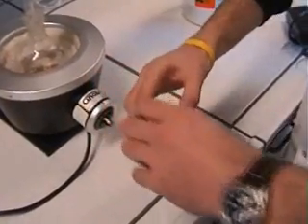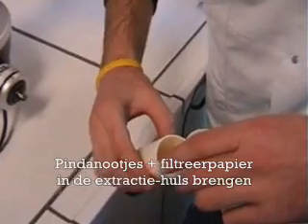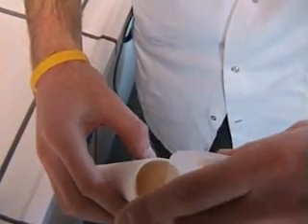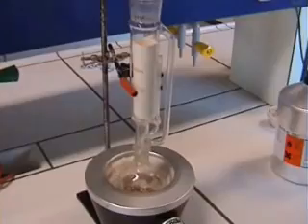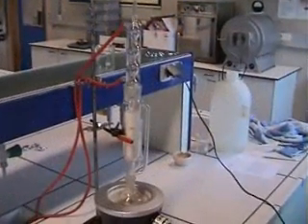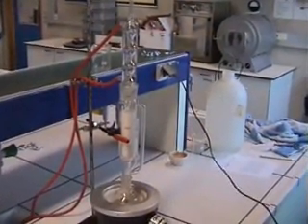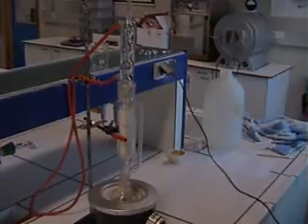De fijngemalen pindanootjes en het filtreerpapier brengen we vervolgens in de extractiehuls. Deze extractiehuls wordt dan geplaatst in het soxletapparaat. Tot slot plaatsen we de liebigkoeler op het soxletapparaat en is de proefopstelling klaar voor gebruik.